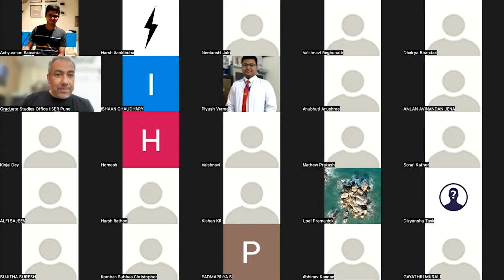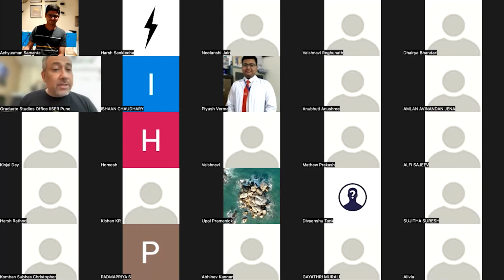Okay. Harsh, your question. Sir, I have another doubt, what is the full form of DIC in that contrast? So let me pull this up. It's differential interference contrast. Okay, which is essentially a technique that is a way to introduce contrast in the image, right? And again, it uses a set of condensers and objectives to be able to do it. Okay, thank you. Harsh, your query next.